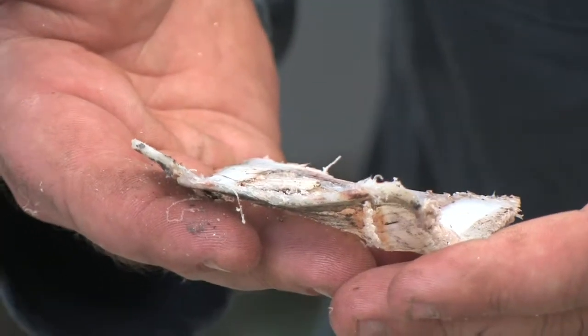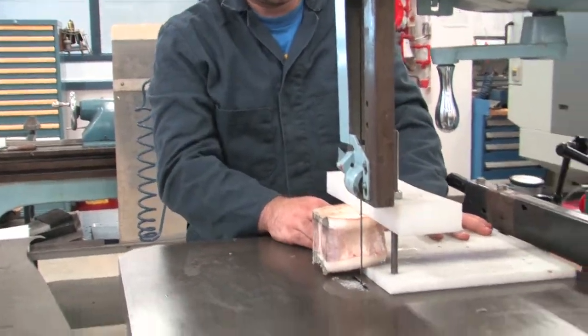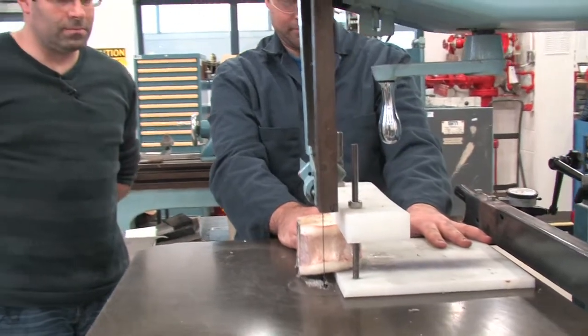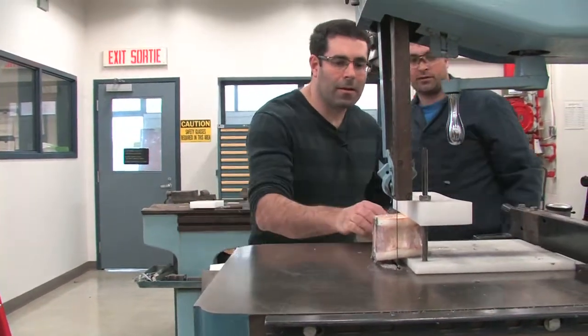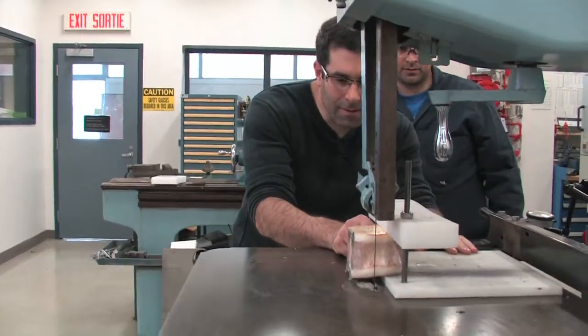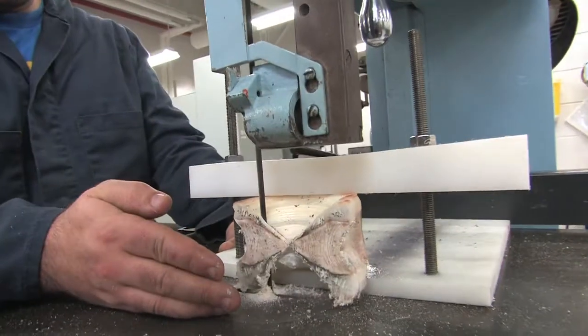After you have a good test cut and the desired thickness, line up the vertebra by eye with the core just to the left of the blade. Make the first cut to the right and away from the core to remove the outer piece of the vertebra. Continue cutting, adjusting the saw guide incrementally each time, and make 3 to 4 cuts through the core.